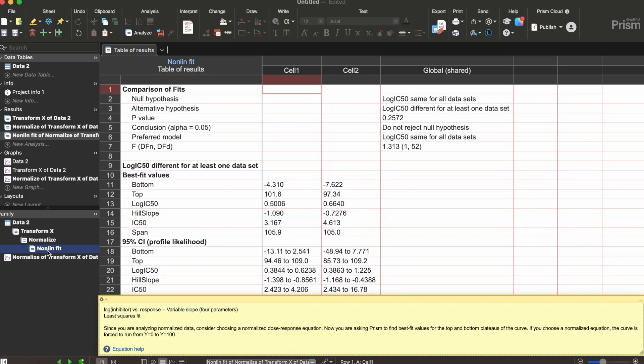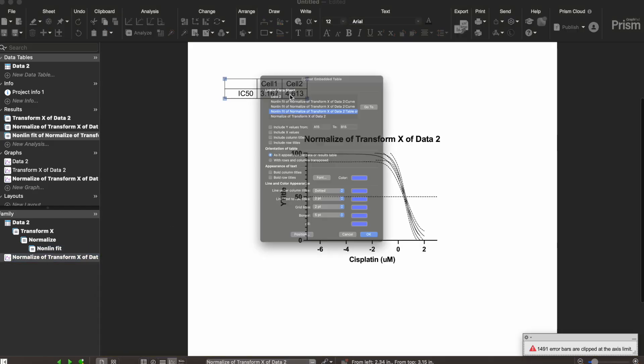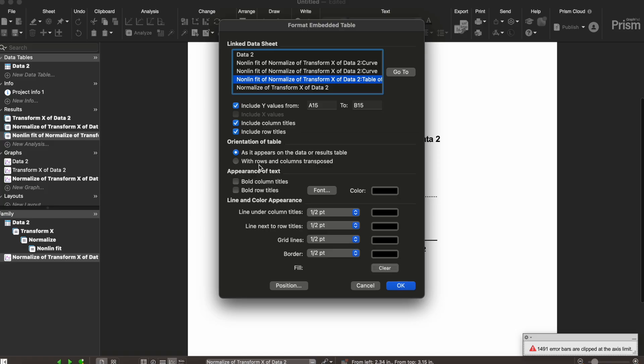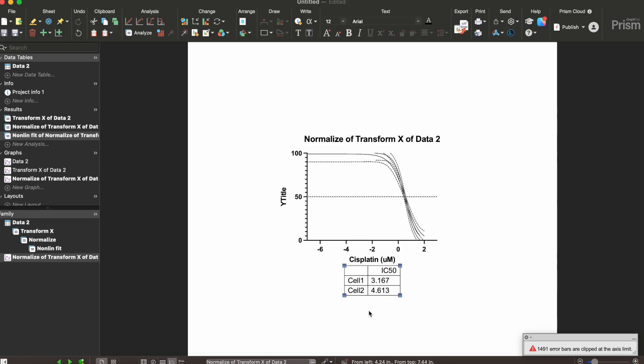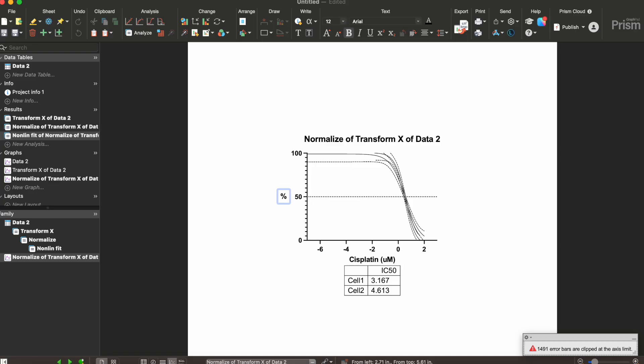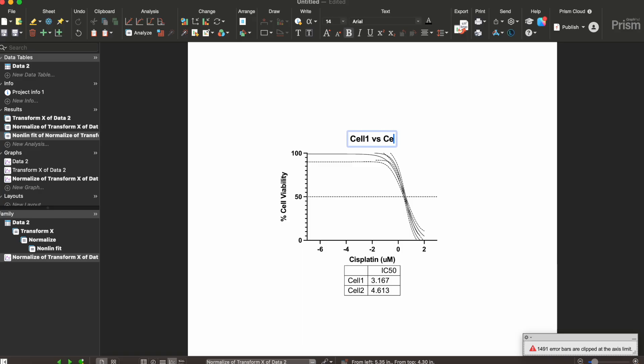If I go to the nonlinear fit tab here I can actually see the IC50. So I'm gonna copy these cells. I'm actually gonna paste them onto this and have the rows and columns transposed and just plop it here at the bottom of the graph. The IC50 of cell 1 is 3.167 micromolar and of cell 2 it's 4.613 micromolar. We're just gonna call this percent cell viability and I can call the graph something like cell 1 versus cell 2 response to cisplatin.